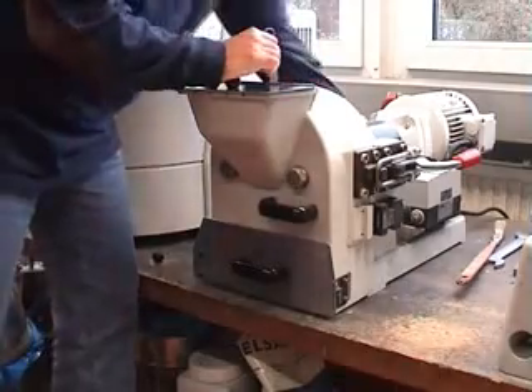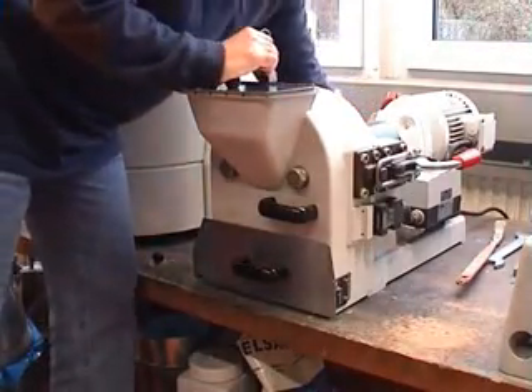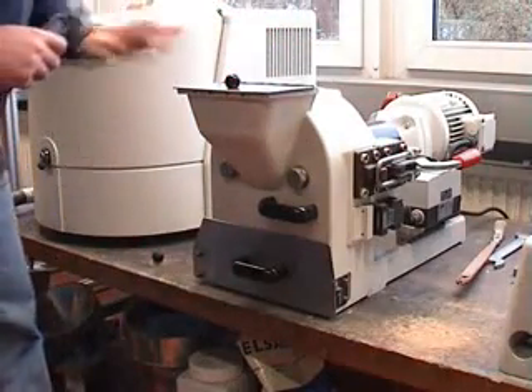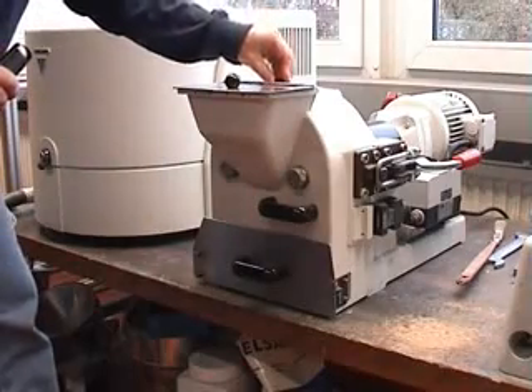At the other side of the mill is a spindle, and with that spindle you change the gap between the two discs. Afterwards, when the setting is done, it will be closed again.